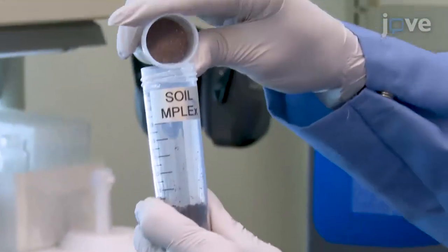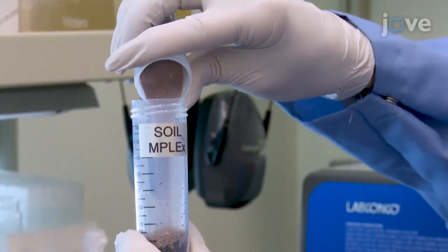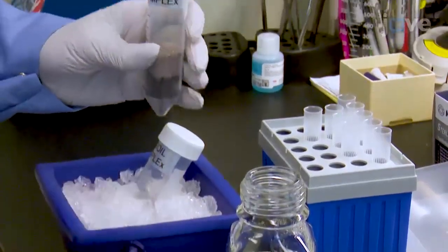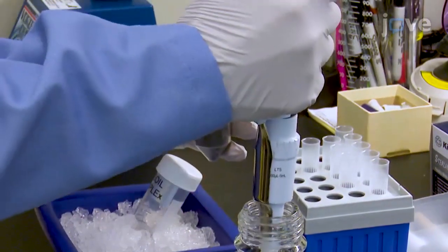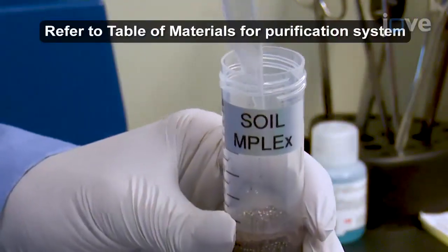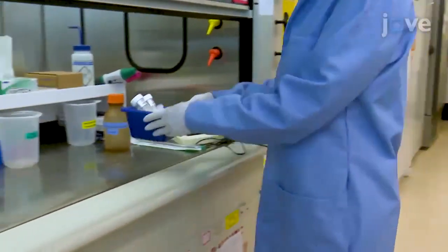Add approximately 10 milliliters of chloroform-washed stainless steel and garnet beads to each tube. Then, while on ice, add 4 milliliters of cold, ultra-pure water to each tube, and transfer the samples in an ice bucket into a fume hood.